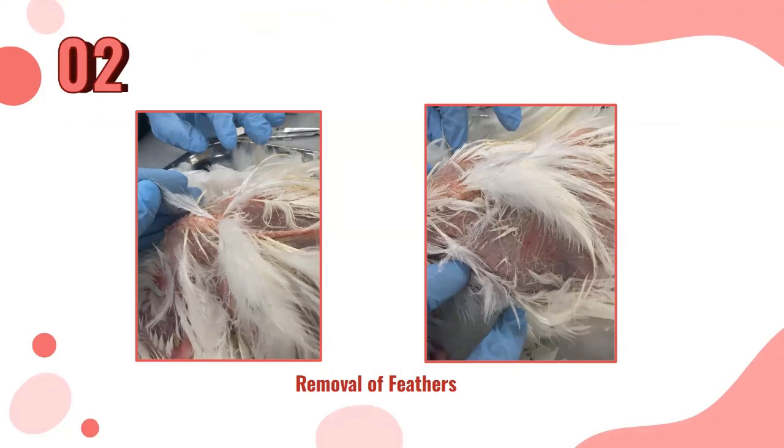Begin by removing the feathers. We first removed all the feathers from the higher neck to the breast, abdomen, and legs.